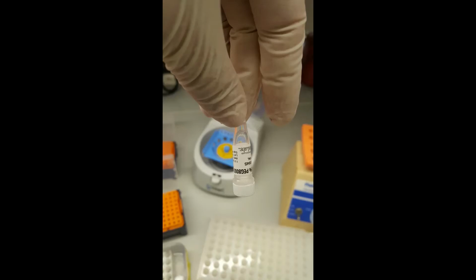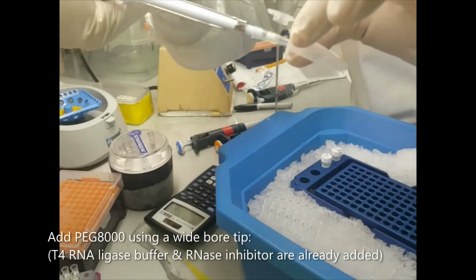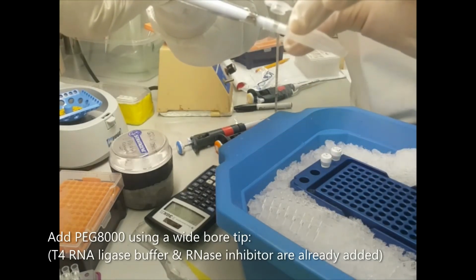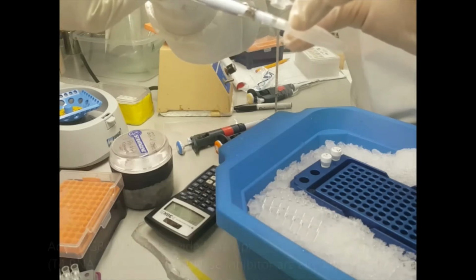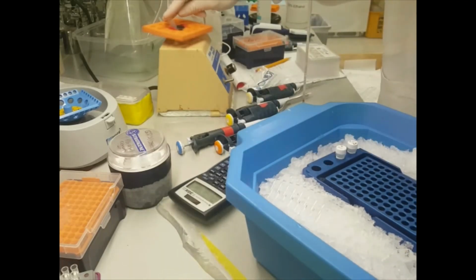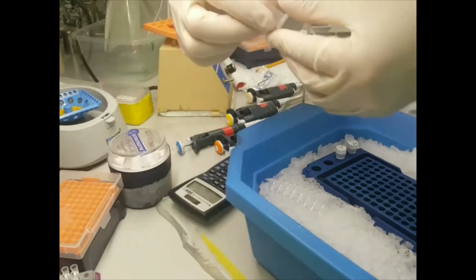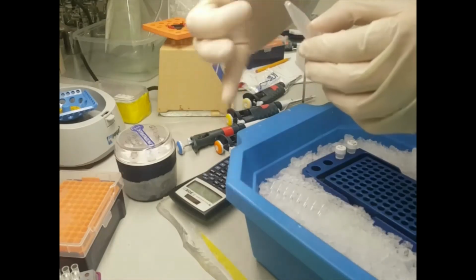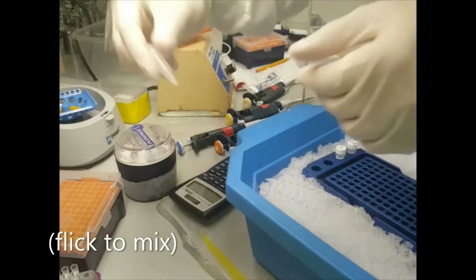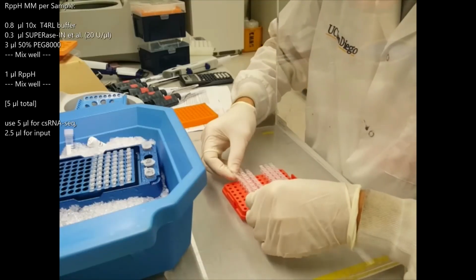Start off your RppH master mix by pipetting the T4 RNA ligase buffer into a 1.5 ml tube. Next, add the RNase inhibitor as well as the PEG. Consider using a wide bore tip to pipette the PEG. Mix everything vigorously by inversion and vortexing, then quick spin before adding the RppH. Once the enzyme is added, again mix the master mix really well, and then pipette 5 microliters of the master mix into PCR strip lids.